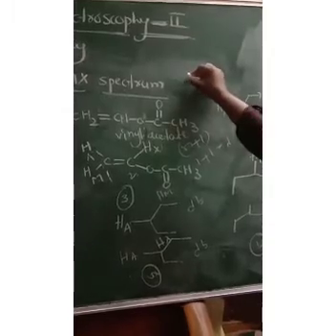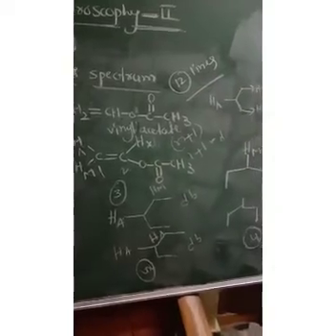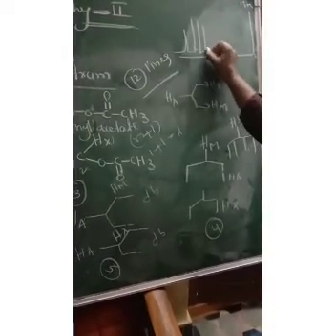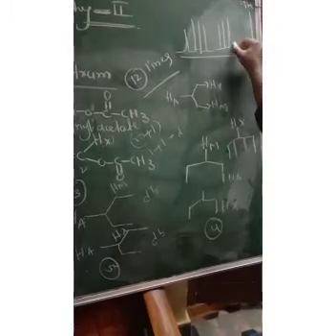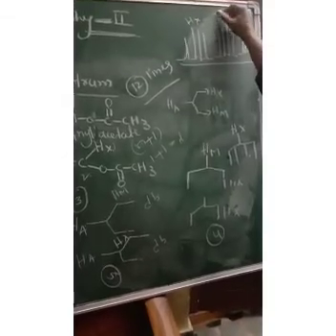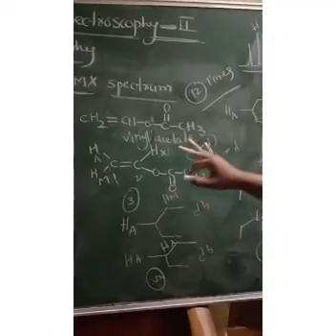Completely, this AMX spectrum gives 12 lines in the proton NMR spectrum, with 4 lines each for HA, HM, and HX relative to TMS. So 12 lines appear for the AMX type of spectrum, and it is slightly different because the coupling is completely different.